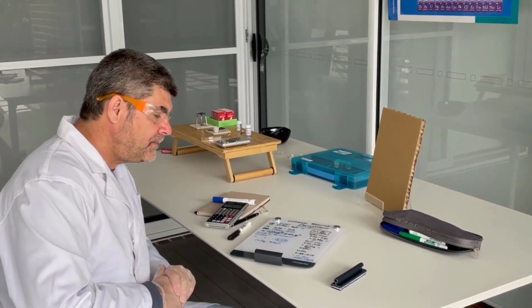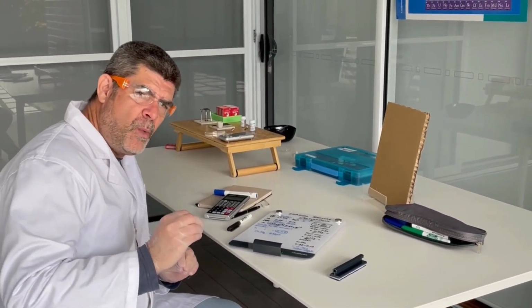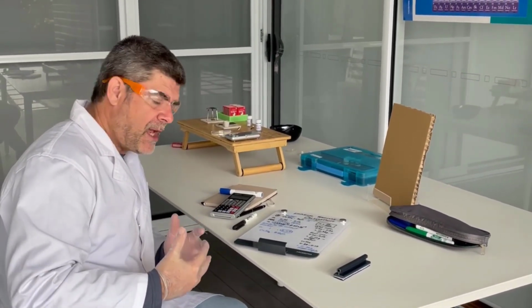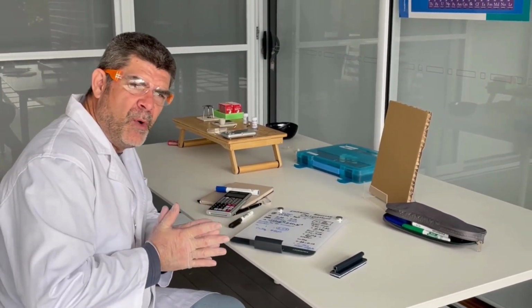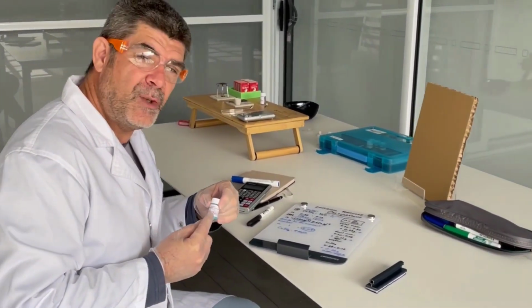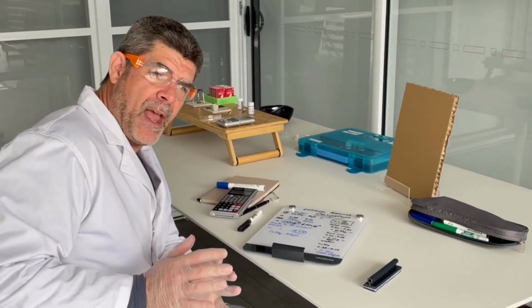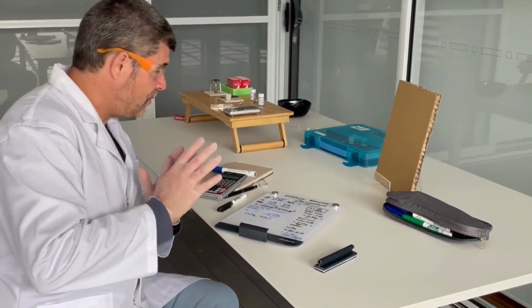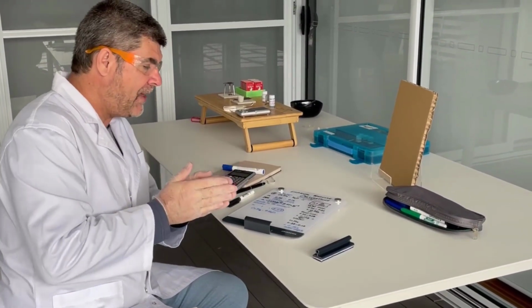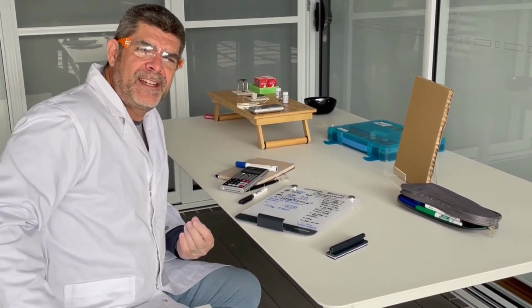Once again, the important thing about these kinds of calculations is that you know what to do with the numbers. Hopefully in questions that you get during examinations, the numbers will work out to be a little bit more consistent with what you know. So it would be nice, for example, if our calculation worked out to exactly 5 waters instead of 4.09. But I'm incredibly happy at the level of accuracy that we can get with all of this equipment, and just with one quick go here to give you a chance to look at exactly how this process of calculation of the empirical formula goes. One of them we got spot on, the magnesium oxide.